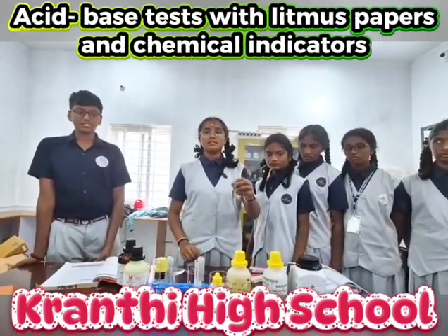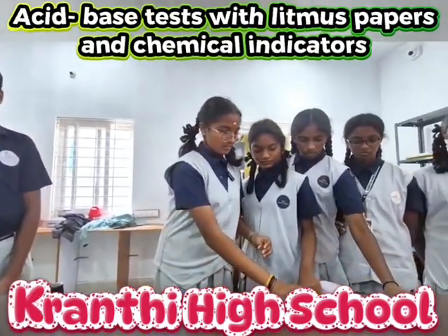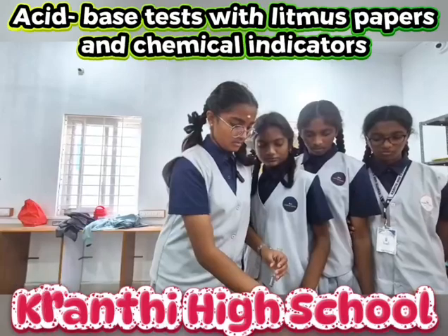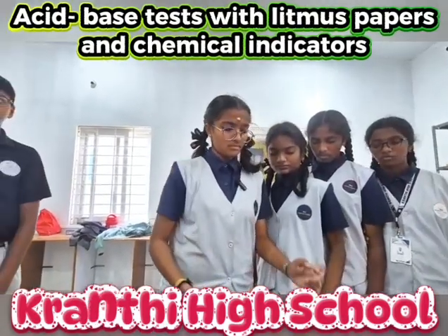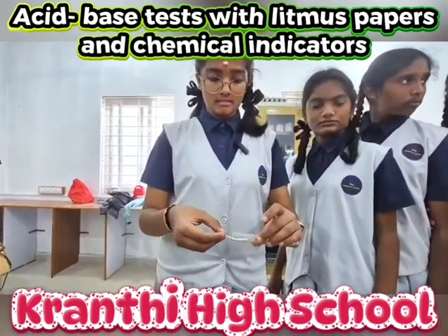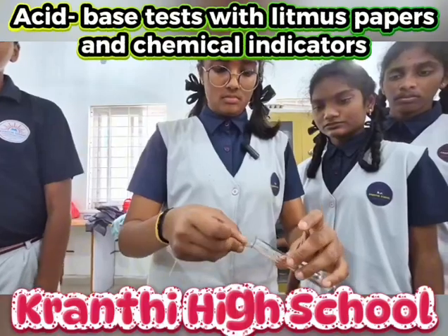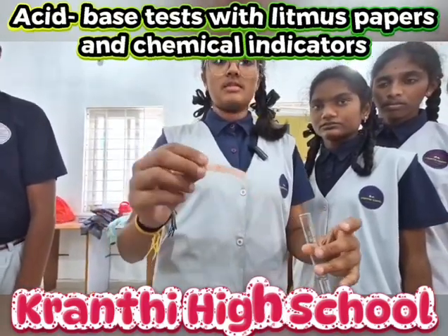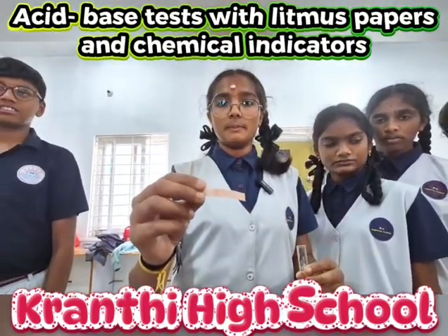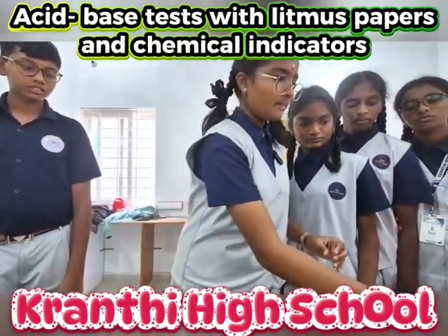As you see here, this is the diluted solution of acetic acid. We will dip red litmus paper into the acetic acid. As you see, the red litmus paper did not change the color, shows that it is an acid.